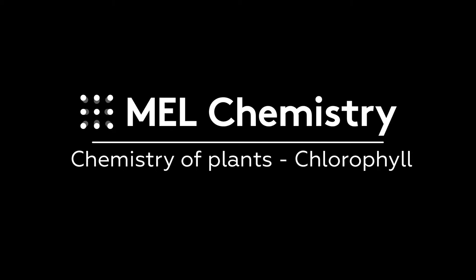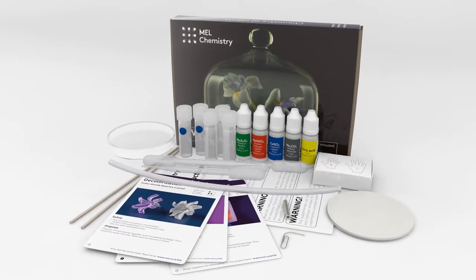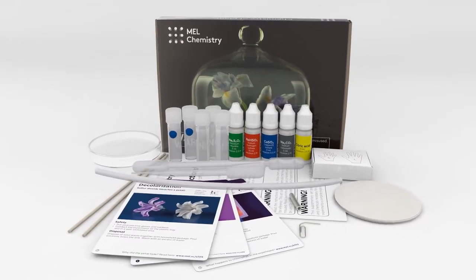Welcome to the wonderful world of chemistry. Today, with the help of the Chemistry of Plants set by Mel Chemistry, we will study the properties of chlorophyll, the pigment that gives plants their lively green color.